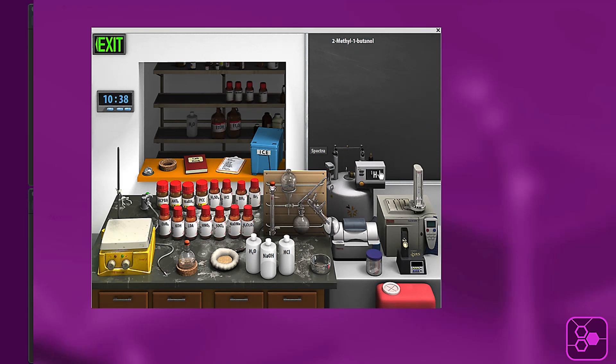Now if you want to take an NMR, you see we have this NMR instrument here back behind the bench. There's this little screen that right now says proton NMR on it. If you hover your mouse you'll see that it tells you you can switch to C13 just by clicking. And if you click again it'll switch it back to proton. So for this example we're going to do a proton NMR.